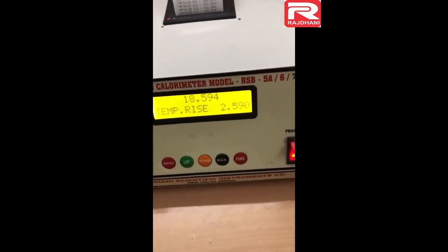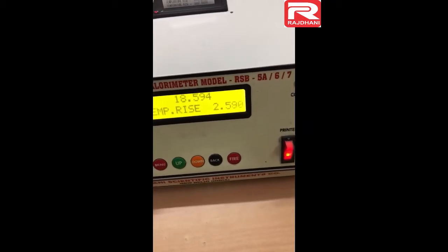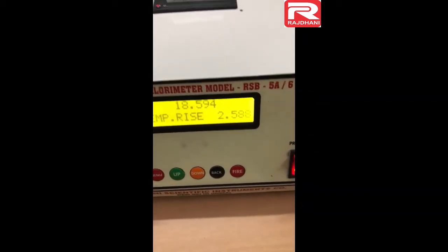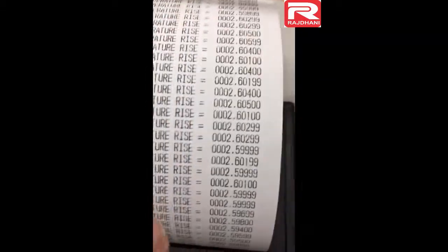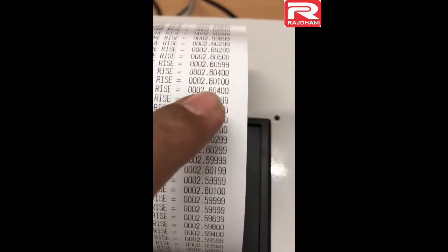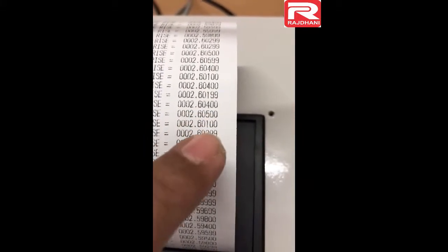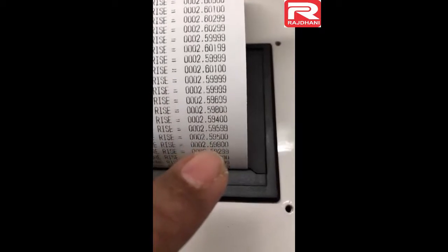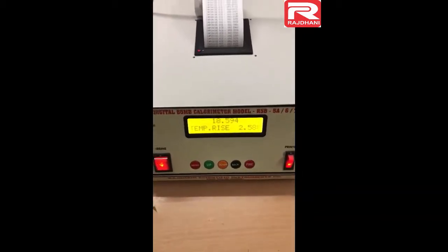You can see the temperature rise has risen to 2.592 within 50 minutes. It may rise to a higher value and then come down. The temperature rose to 2.601, 2.604, 2.605, 2.601, 2.602 — and now it is going down: 585, 585. So it will use the maximum temperature rise for the calculation.